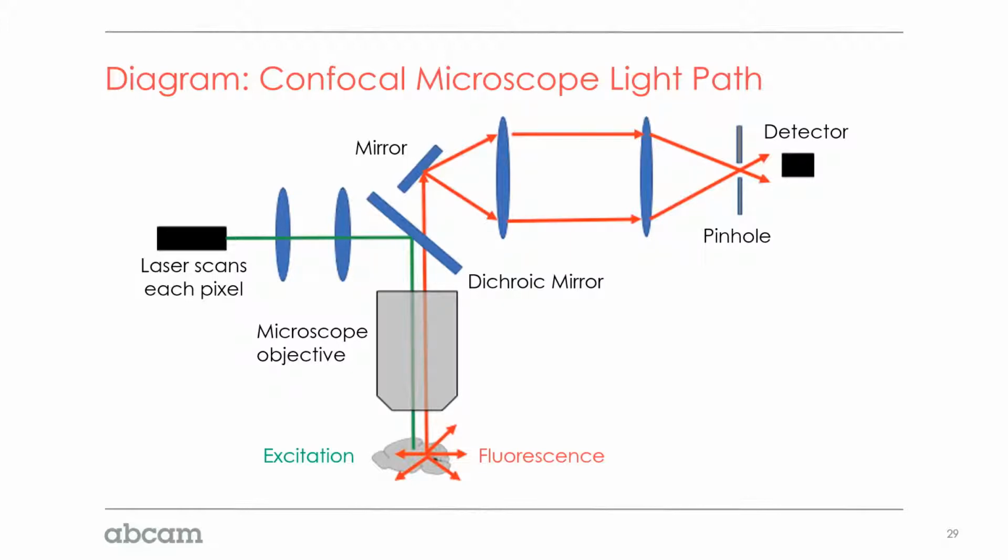And overall, if we're imaging a tissue for a long period of time with confocal microscopy, by the time you get to the bottom of your tissue, or the top of your tissue if you start at the bottom, you're going to have quenched all those fluorophores, and you might not get any signal back from your detector, and that creates a lot of problems with trying to get uniform imaging throughout that depth. So with confocal microscopy, that's always a consideration, that quenching, and that's why we always suggest using a thinner tissue section for confocal microscopy, because of that effect.